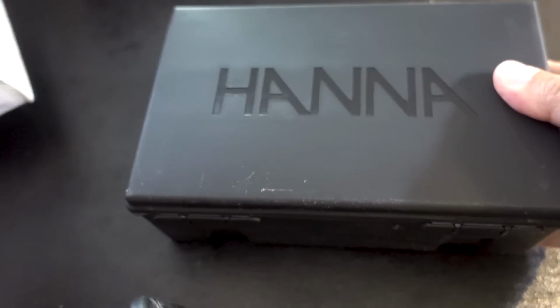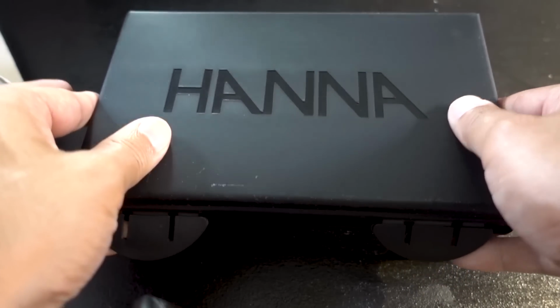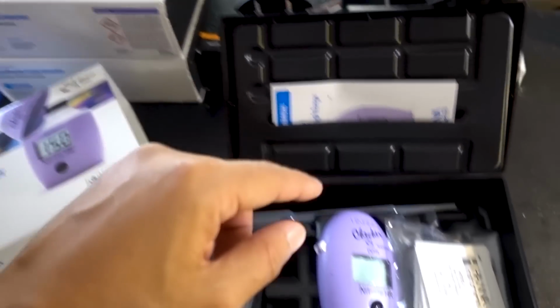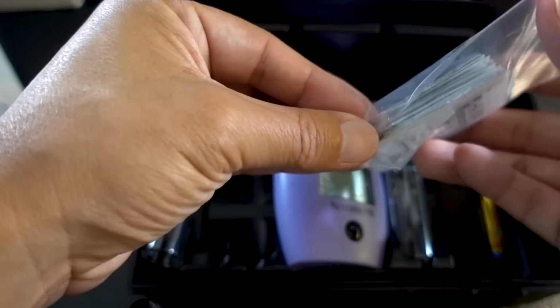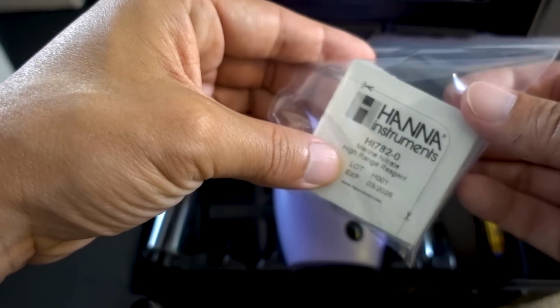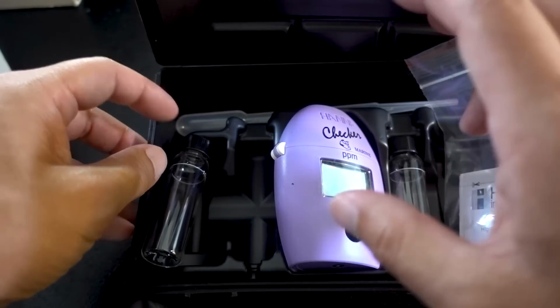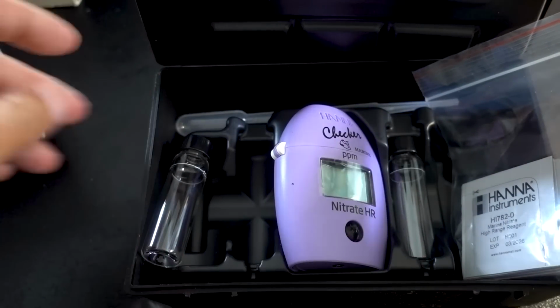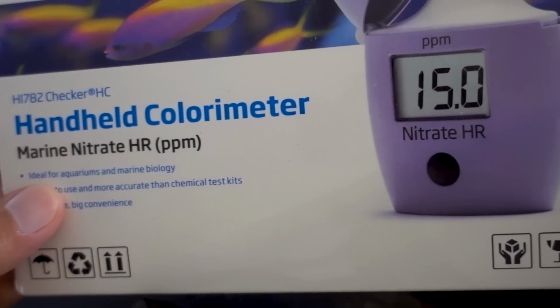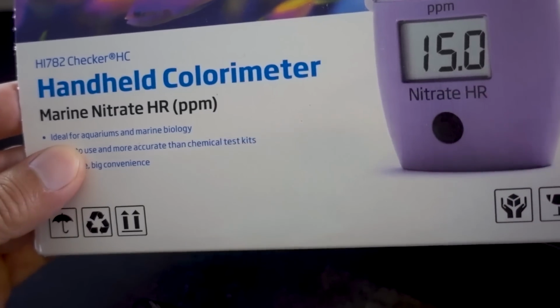All right, so from what I understand, this checker is supposed to be super simple as well, similar to the phosphate checker, basically just one reagent pack. It looks like it does not initially come with a lot of the nitrate tests, especially considering how often we'll do nitrate tests, but I hear that this test is really simple, unlike the low range nitrate checker. While that nitrate checker is nice to see the actual number, there are multiple steps.